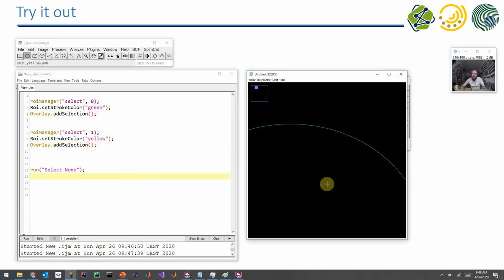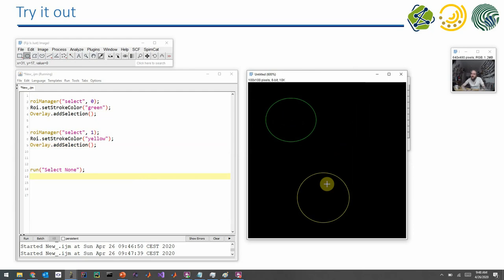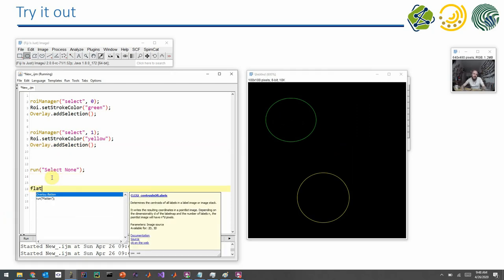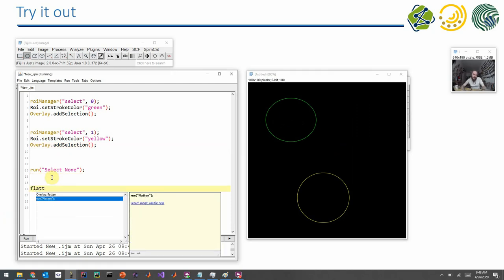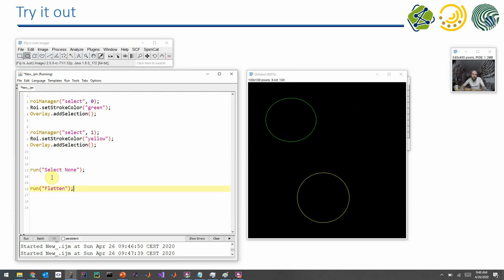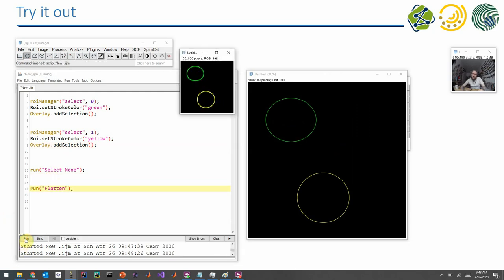However, if I want to save this image in a way that also other programs can open it and can show the outlines for visualization, to show it in PowerPoint, for example, I have to flatten this image. The command for flattening is this one. And if I execute this one, I get another window. Then obviously the pixels are changed.